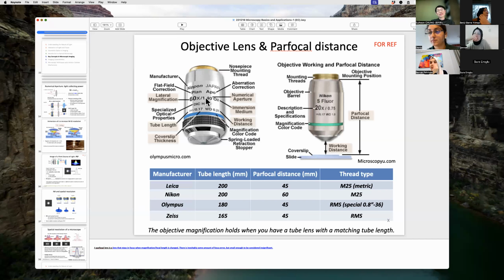determines the optical resolution. So you're changing this, but the tube lens remains the same. So you are changing the objective lens. You may remember the nose piece. Good question. Yes, there's Barry.